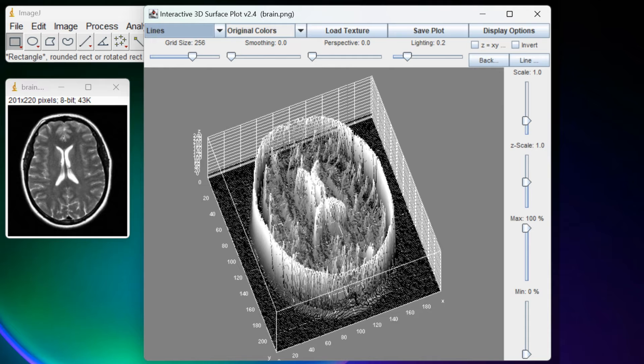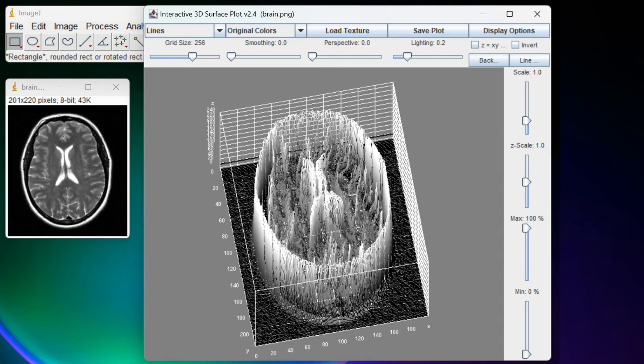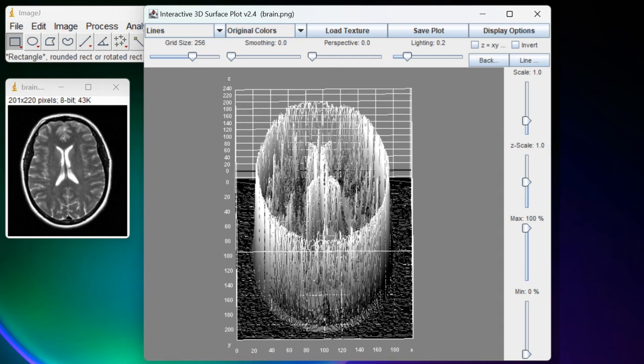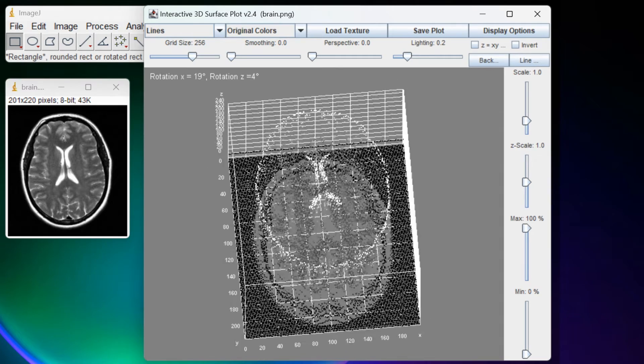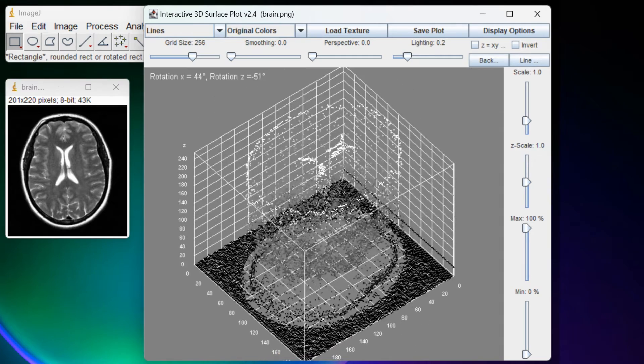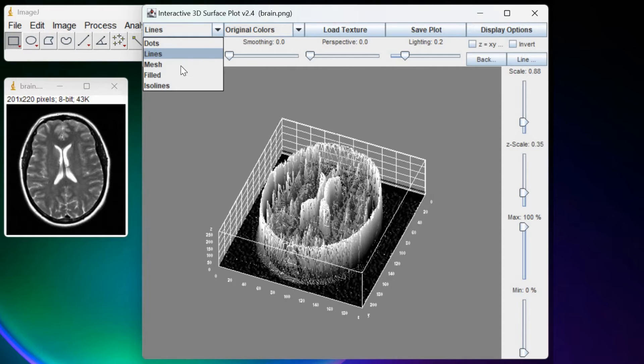Here you can see this cool 3D plot, and you also get a lot of controls. You can rotate the plot by holding the left click and moving it around. You can choose the Mesh option instead of Lines.